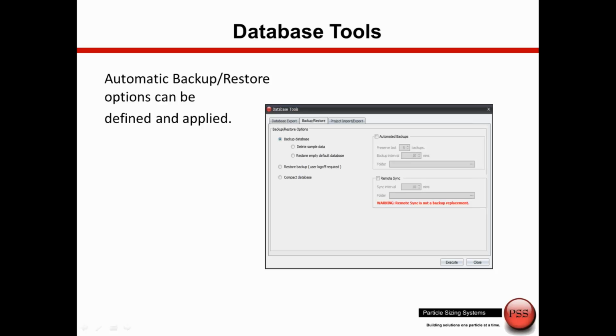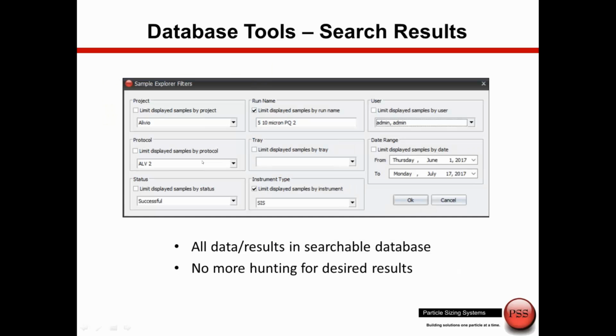Another very useful database tool is we can have it automatically back up our data. So not all of us are completely perfect at making sure we back up our computers all the time, but we can automatically have this set up so it will back up the data, and we can restore it if we need to, if there are any issues down the road with how our data has been stored.